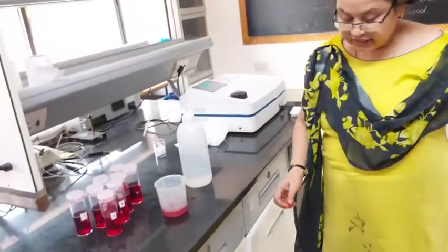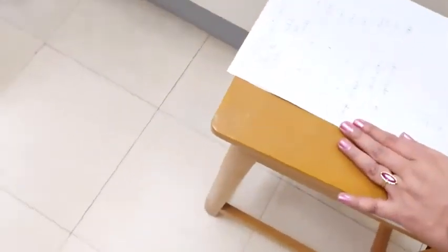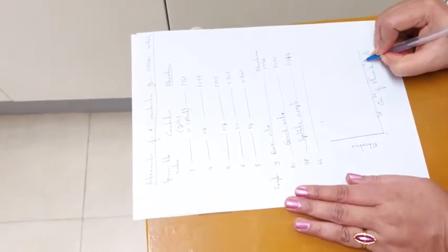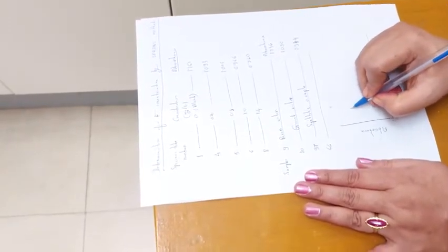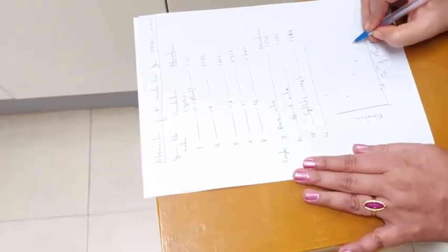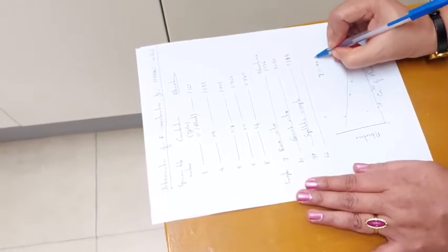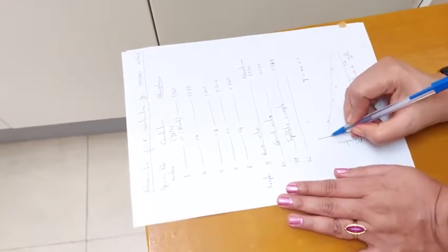Now we have to plot a calibration curve. On the x-axis, it will be the known standards 0.4, 0.8, 1, 1.4. Then corresponding absorbance values are coming from higher side to lower side. Beer's law is followed in an inverse way. Then we fit the best fit line. Then we'll be using the equation y equals mx plus c. M is the slope of this particular straight line and c is the intercept on the y-axis.